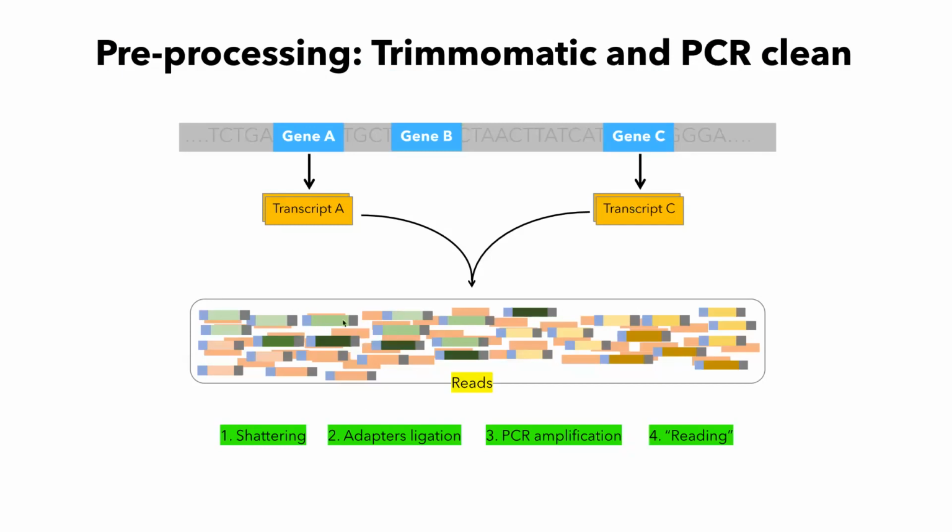So at the end of each one of those fragments, we have a beginning and an end adapter. Then these are amplified, so the amount of reads is amplified so that the reading of the material is clearer. And that's when the reading happens. So the actual reads that we are looking at in FASTQ files include the adapters and they include PCR amplification.